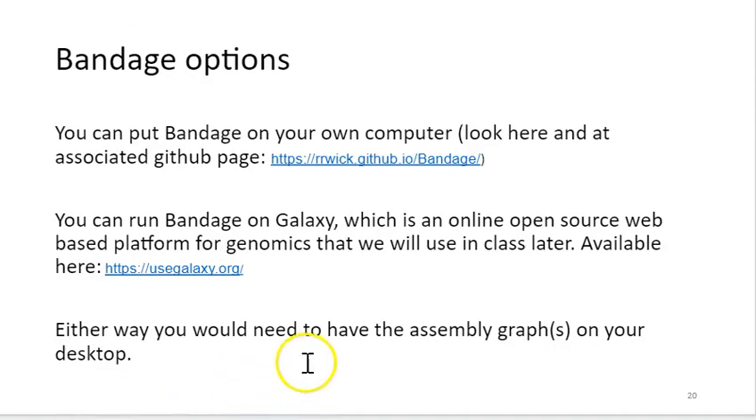You can access Bandage in a couple of ways. You can download it and put it on your own computer — directions are at Ryan Wick's GitHub page, and Mac users need to pay attention to use the right specifics. Or you can access Bandage on the online platform Galaxy, which is designed for community-sourced genomics work. You can do a lot of what we do in class on Galaxy, and we'll be checking that platform out in various ways, since you won't always have access to a resource like RON. Bandage is loaded there — you can upload your assembly graph, view the graph, and look at summary statistics on assembly quality metrics.